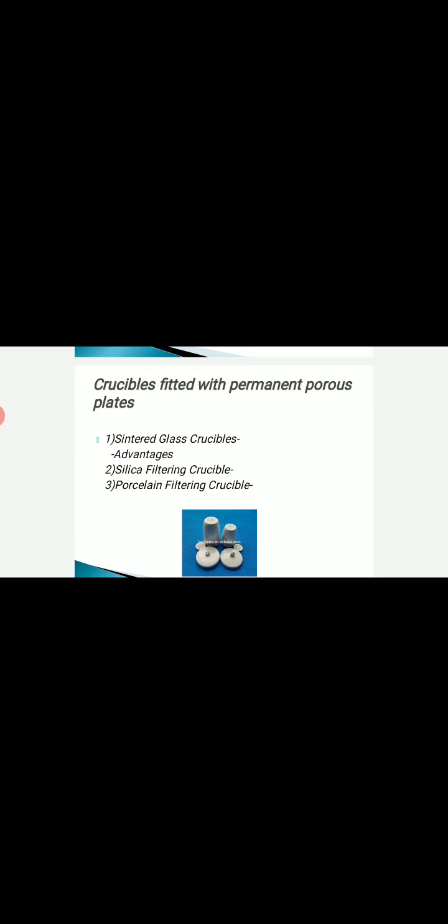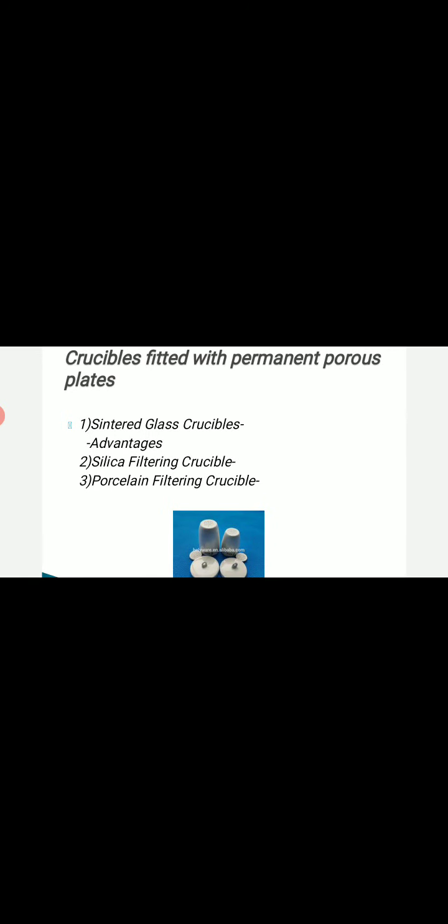They are also available in different porosity sizes, numbered in the market as 1, 2, 3, 4 and so on, with pore sizes of 100 to 200 microns, 40 to 50 microns, 20 to 30 microns and so on. Generally number 4 is suitable for the filtration of barium sulfate precipitate, and number 3 is suitable for medium size particles.